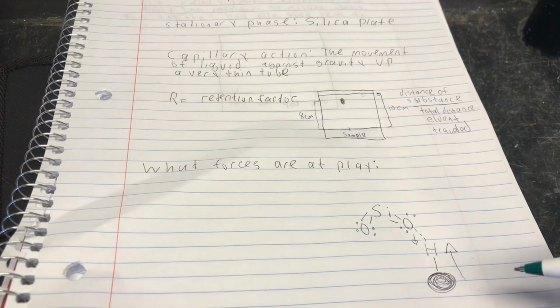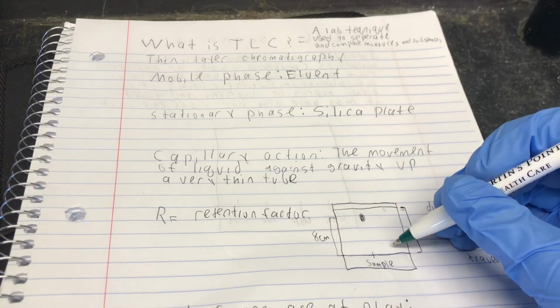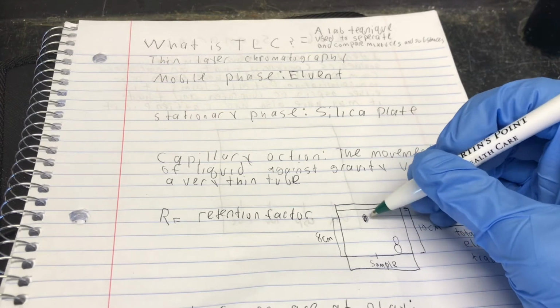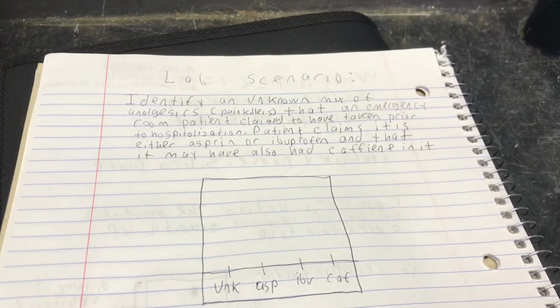Going back to retention factor, a more polar substance will end up, I don't know, maybe here or here, while a more non-polar substance will end up there. Real quickly, we're going to go over a little scenario that we're going to be doing today in terms of the actual example and demonstration of this technique.